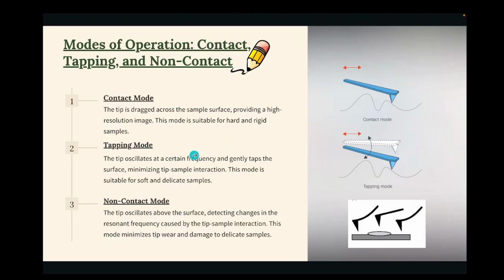The tapping mode is generally used when the cantilever is in vibration mode. So it taps just like a stitching machine. It taps one point, and the force is noted, because when the tapping occurs, it is occurring at a constant force. But when the material changes, the force which the cantilever is acting with now changes, and that force is recorded. So generally the tapping mode is used for determining the nature of the material. What is the nature of the material?